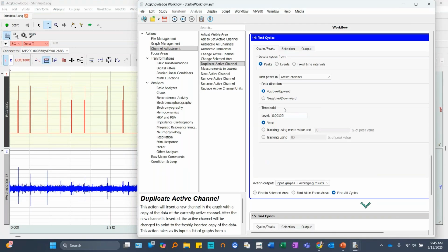You go in and pre-identify it and play with the file to see where that threshold is and what you're happy with. That's why I prefaced things earlier by saying it is always important to get eyes on the data to make sure that what you're trying to extract from the data is actually being extracted.